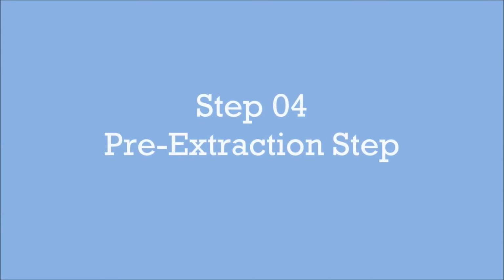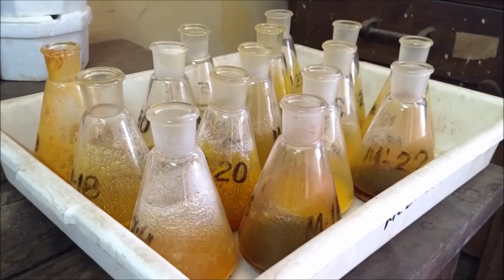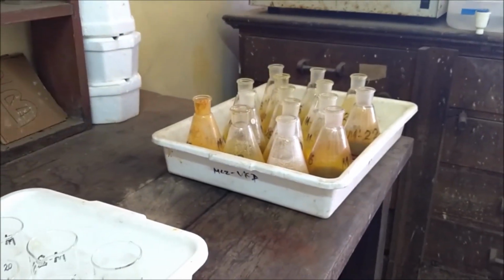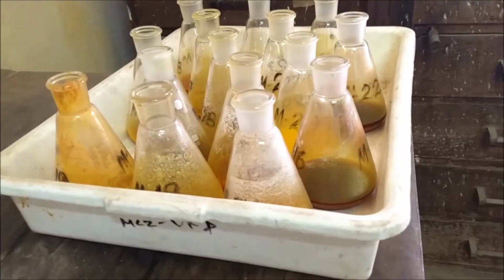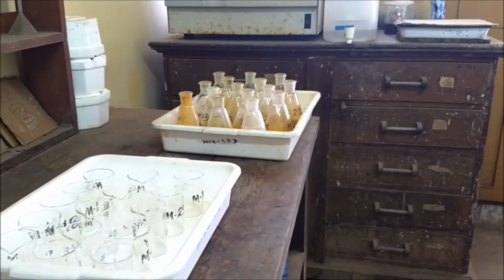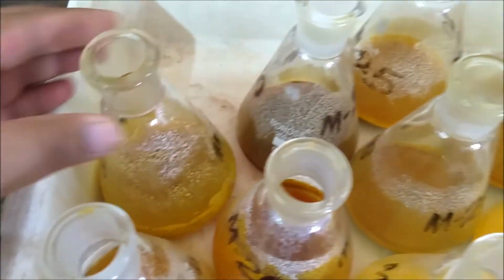Step 4. Pre-extraction step. In this step, we are going to prepare our samples for extraction. These are the hot digested samples which have been cooled to room temperature. Now these samples will be transferred into 100 ml beakers.